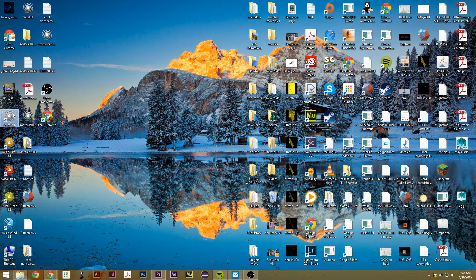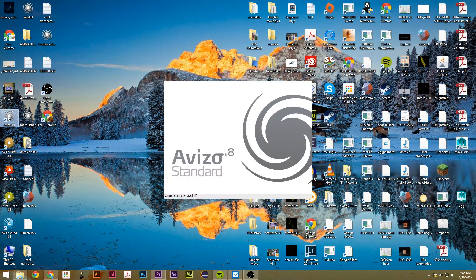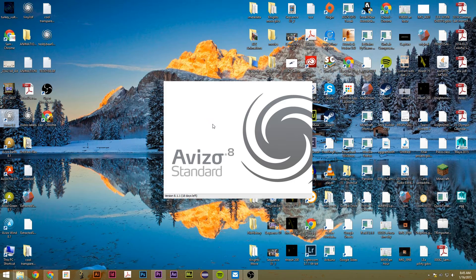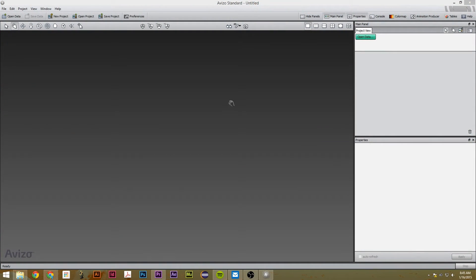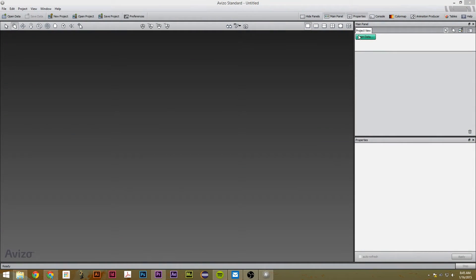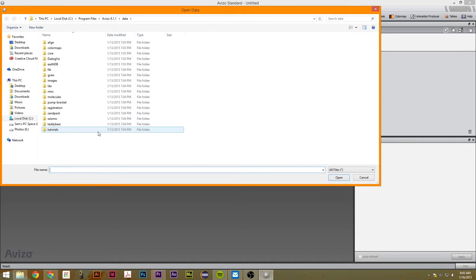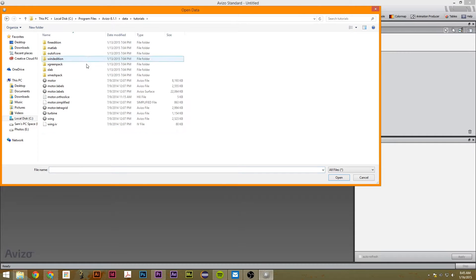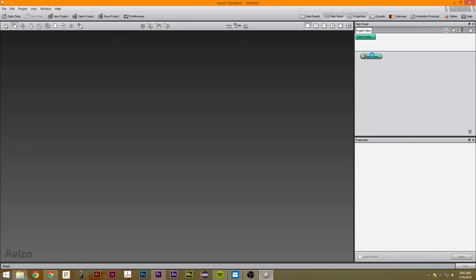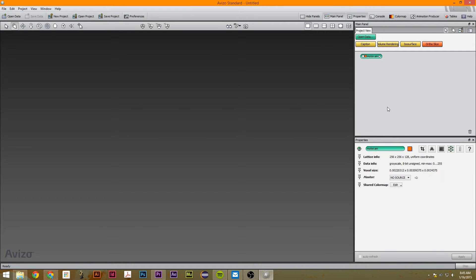The first thing we're going to do is just open Avizo 8.1 and we're going to go up here and open data to tutorials and then we're going to go to motor. So once we're at motor, these are the two tools we're going to use: isosurface and orthoslice.